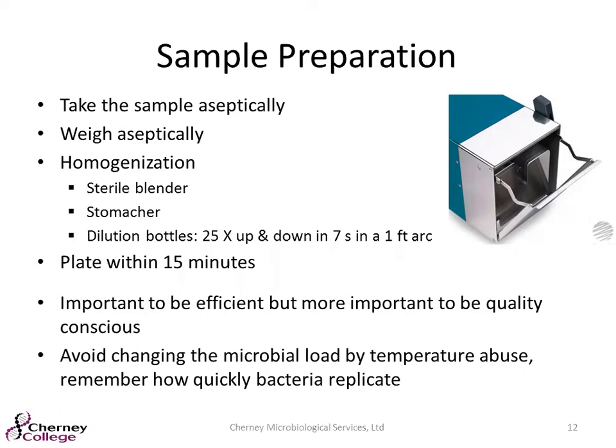Because of those 15 minutes, and you have a ton of samples to process throughout the day, it's important to be efficient, but also quality conscious. So don't take out all of the samples you have to plate for the entire day from the refrigerator and have them sit out on your cart or on your counter. Don't add diluent to 40 samples and have them stomached and then start plating them if you can't get that done within those 15 minutes. So really understand your workload and how much you can do in a short amount of time, and don't temperature abuse those bacteria and those products.